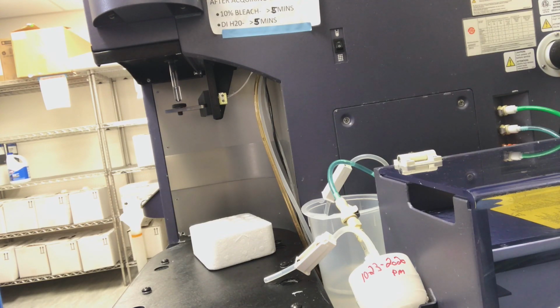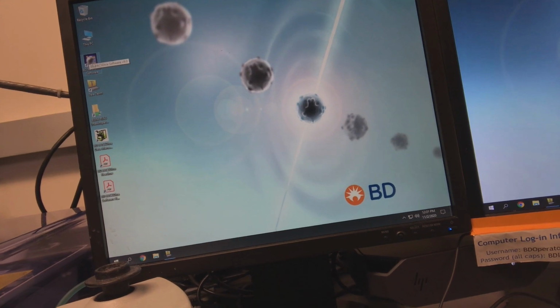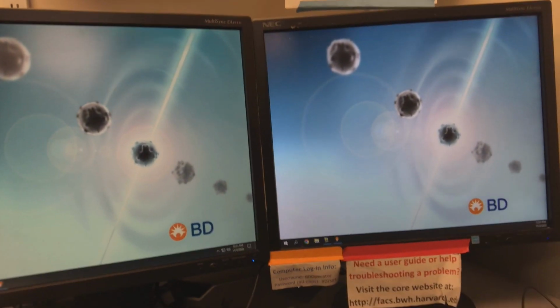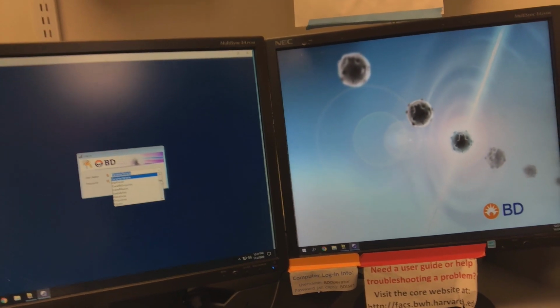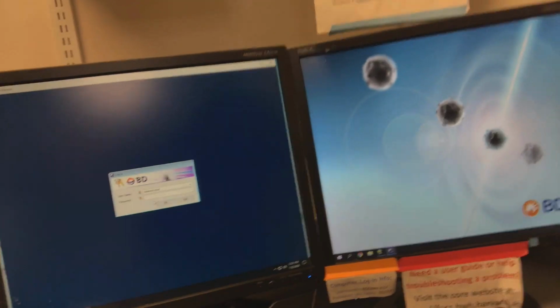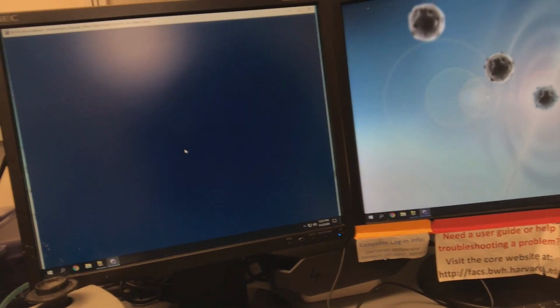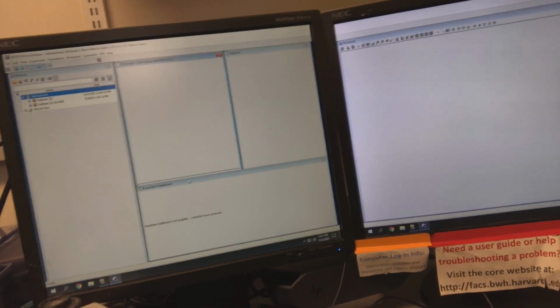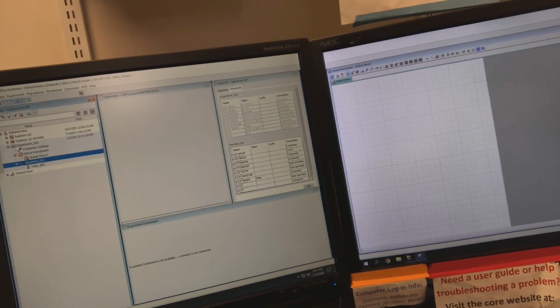Now that we've gotten any air out of the lines, we can open up the Diva software on the desktop. When you've completed your orientation, we'll create your own user account on this computer. For now, I will use mine. Now that we're logged in, we can open up an experiment or create a new one in the browser window. We can create specimens and tubes.